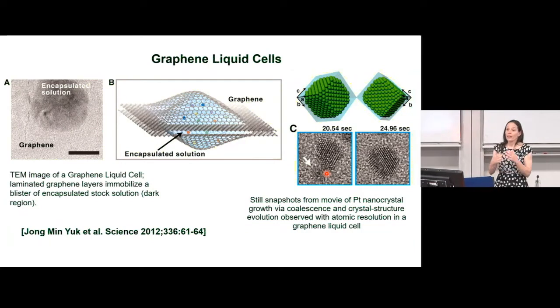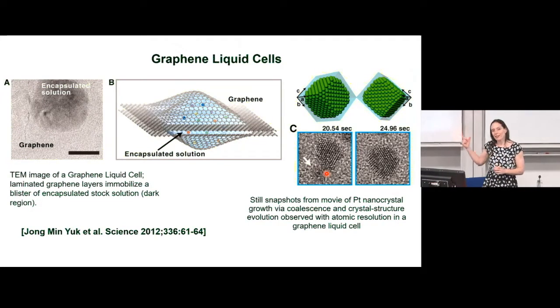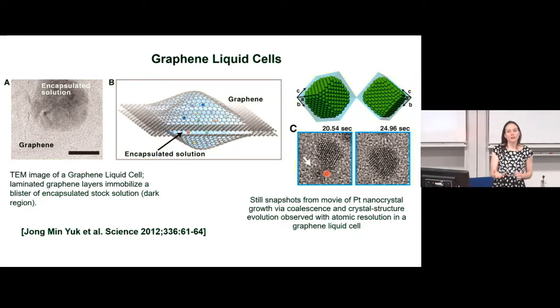And if you're in the microscopy community, that's quite surprising, because this was hugely exciting. The idea of being able to do this imaging of nanoparticles in liquid really set people, oh, why didn't I think of that? I should go and do it straight away. And trust us, there were people all around the world, my group included, who tried. And the reason that we believe this is very difficult is understood if you've ever had some soup and tried to store it in cling film.